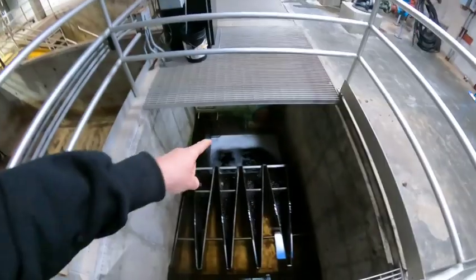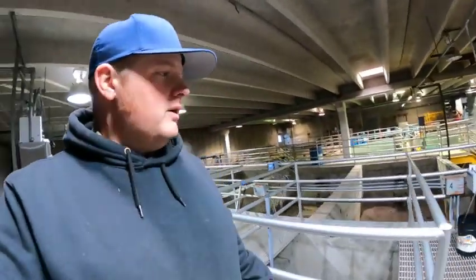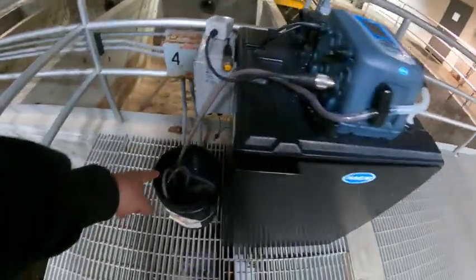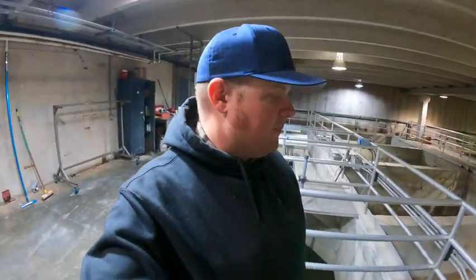It's got its own GPS coordinates and everything else. 001A happens to be right there. Basically, that's where we collect our effluent sample. Here is our automatic sampler, or auto sampler, right here. We have this tube. That tube comes out and drops down into the effluent. We take a composite sample, a 24-hour composite sample.